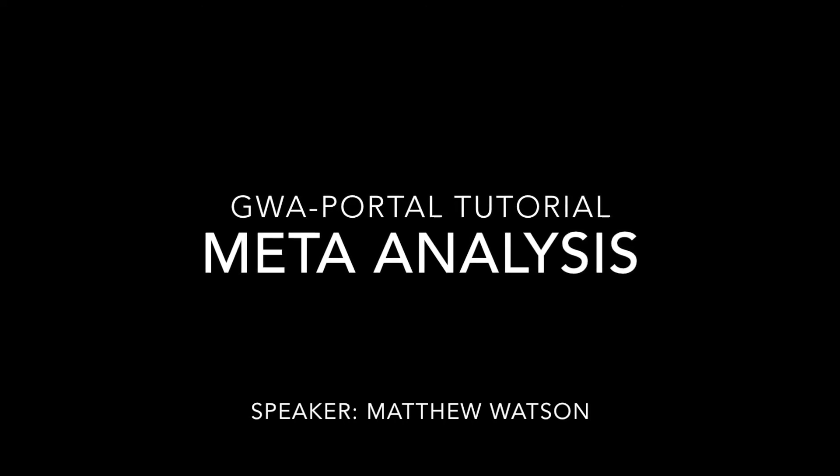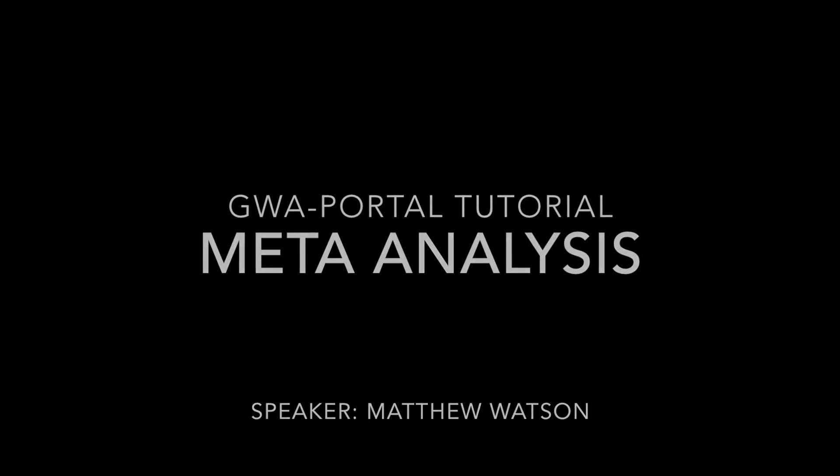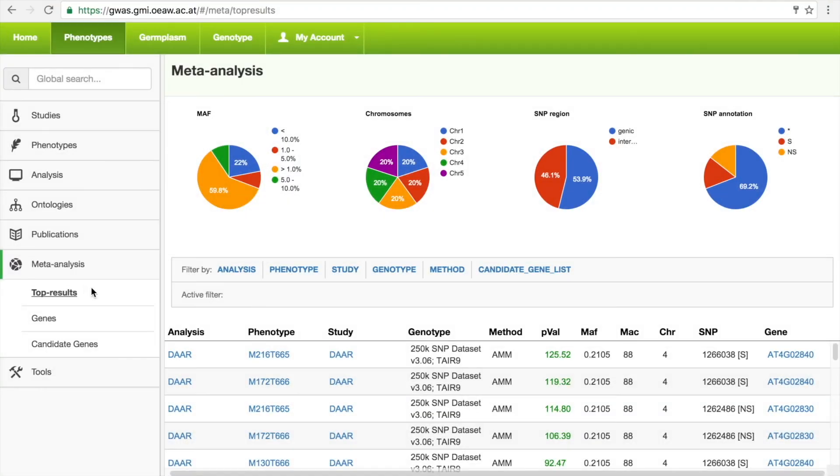After each GWAS run, we store the top 1,000 associations in a very fast database that allows us to slice and dice the data from different angles.